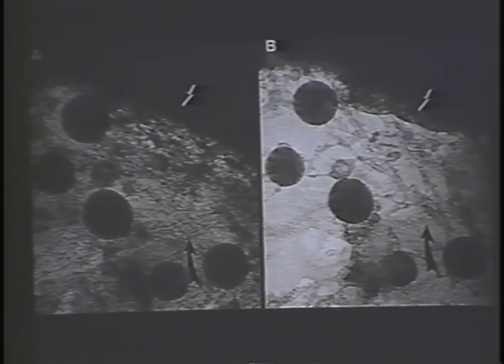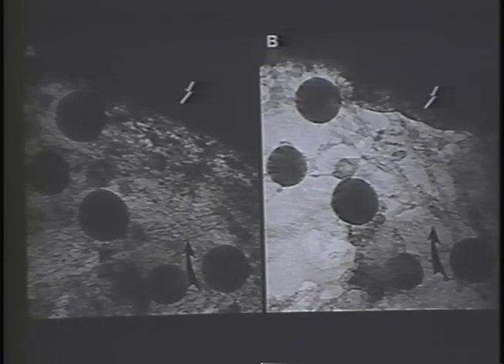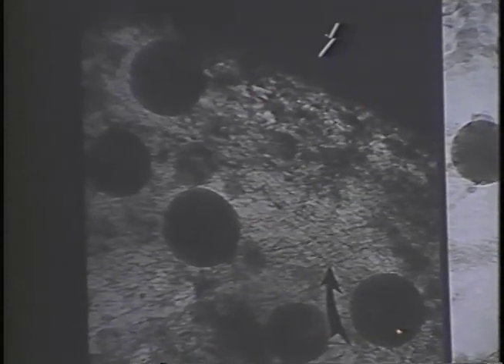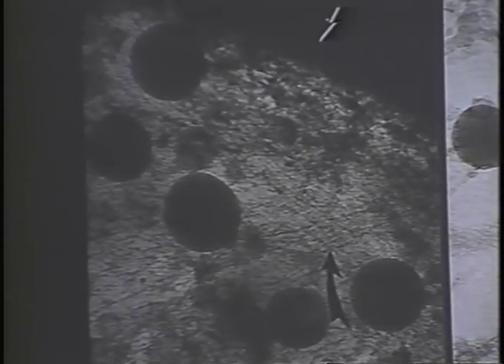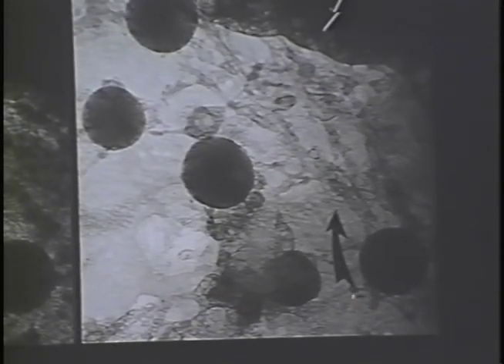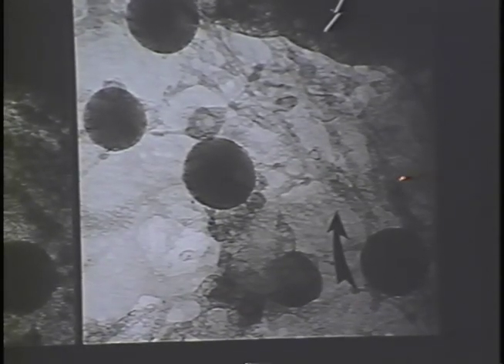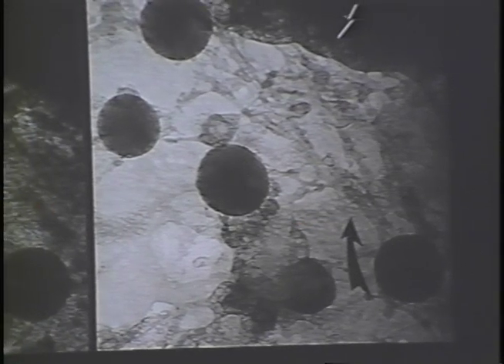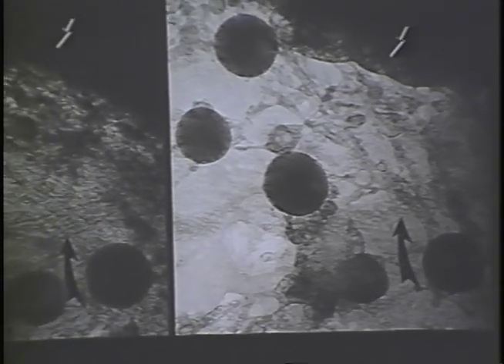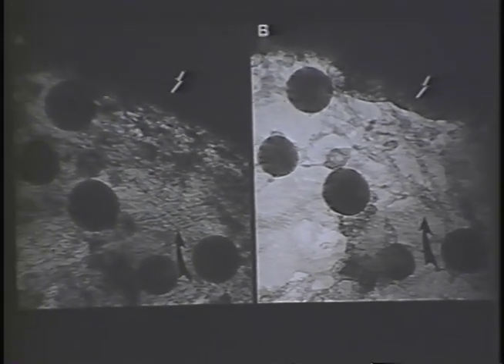At higher magnification, this beam damage is even more apparent. Panel A shows a thick portion of a frozen PTK cell after exposure to a total electron dose of about 5 electrons per angstrom squared. After a total dose of over 100 electrons per angstrom squared, one can see this characteristic bubbling of the sample and a complete loss of fine structure. This type of beam damage is unique and characteristic of frozen hydrated material.